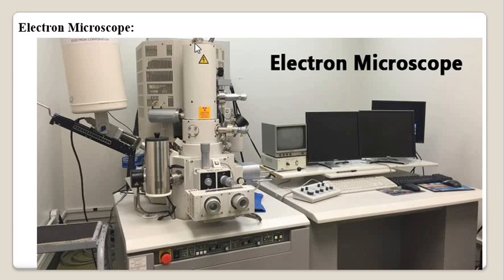It consists of a hot tungsten filament. It is a source of electrons forming the beam, and the tungsten filament is surrounded by a negatively biased shield with an aperture through which the electron beam is thrown off to the grounded and positive anode, which is located at the bottom. Towards there, the electron beam is being transported, or it has been directed.